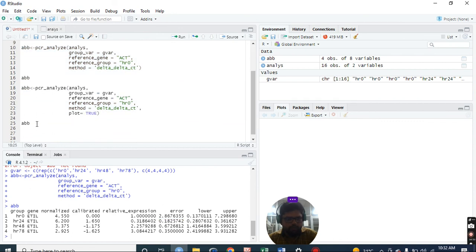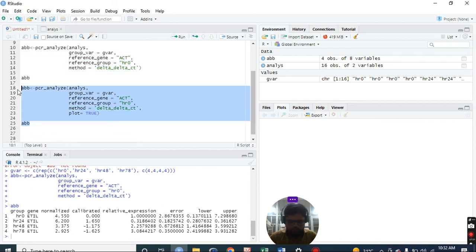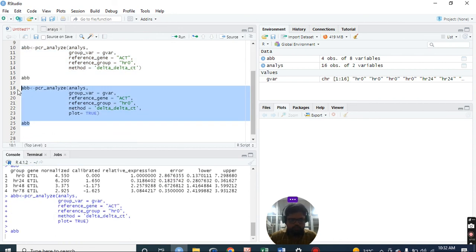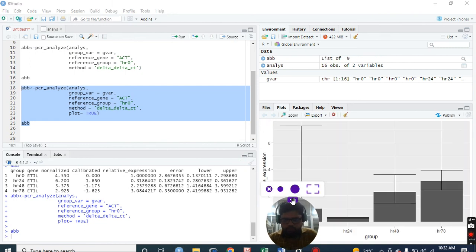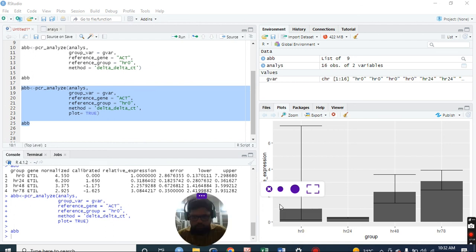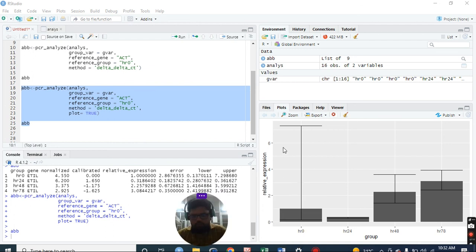The same thing if you want to get the plots - just run it, control. You'll get the plots here. This shows the higher standard error - zero hours, 24 hours, 48 hours.